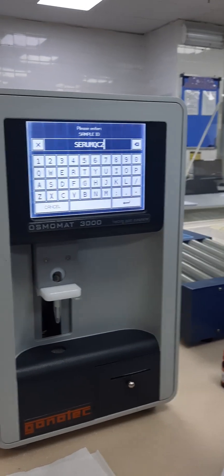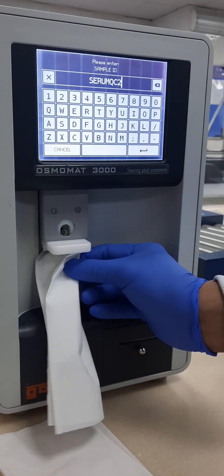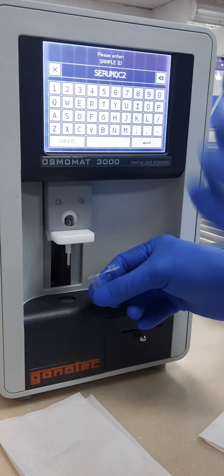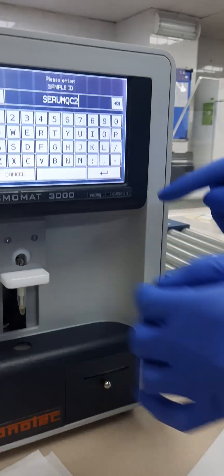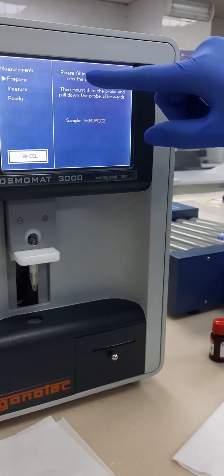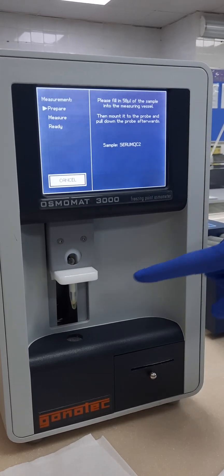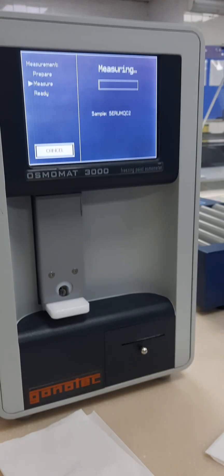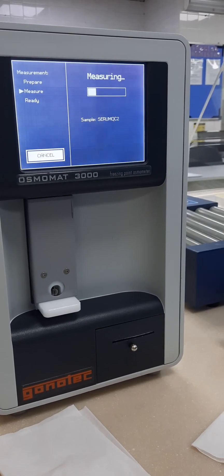This one I take already. Whatever you make, remove this one and clean the probe with a fine tissue only — not force, slightly only. There is one sound that will be coming. This one will be coming, but then it will say 'please fill 50 microliters of the sample into the measuring vessel.' I already filled — you make this by force like this. So until that, I will make the level 3.